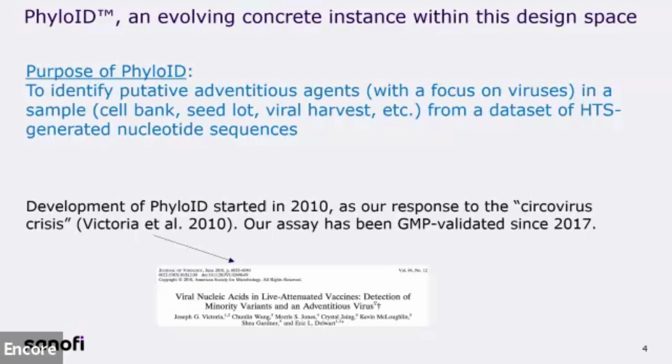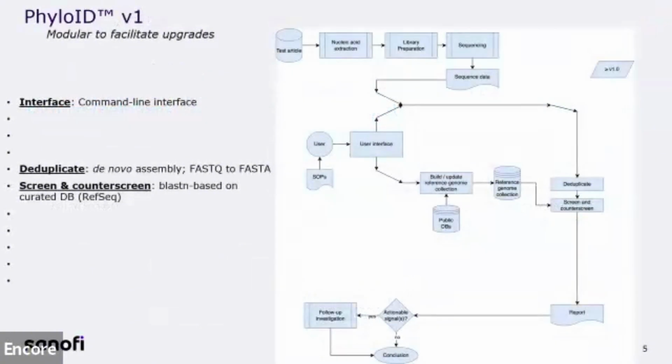And now it was clear that it had a very important viral safety aspect. So 2010, and then the assay, that includes all of the wet lab and the bioinformatics, was finally validated in 2017. So it did take a lot of development work. And back then, people weren't so sure about whether this was the thing to do. And I'm going to talk about that.